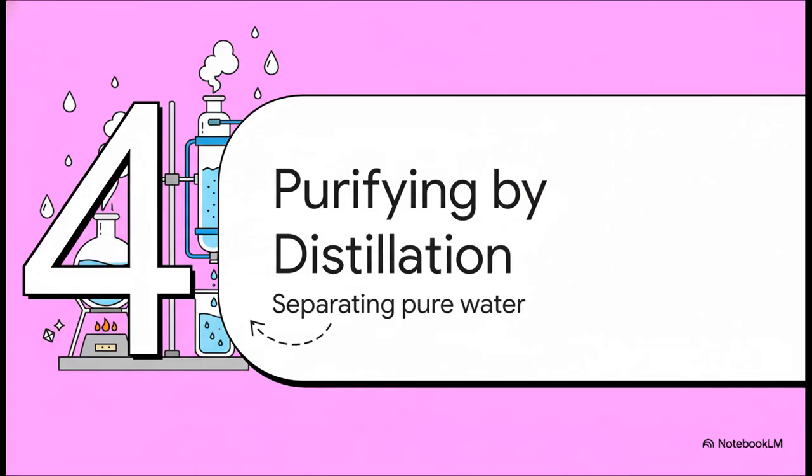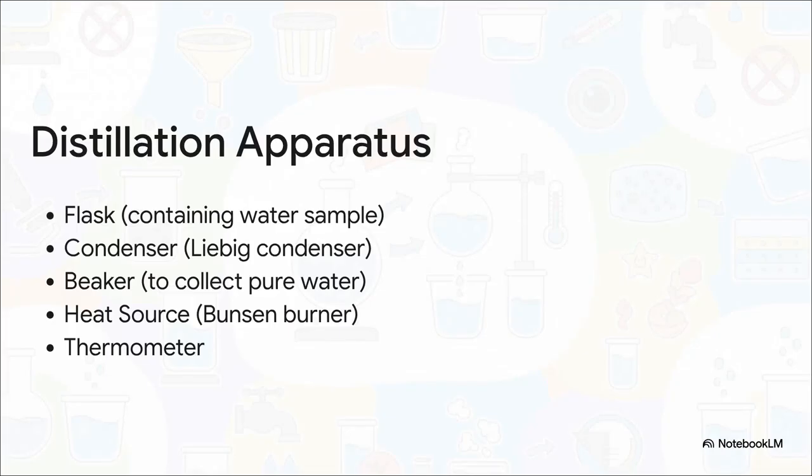Okay, now for the main event, the purification. We know there are solids dissolved in our water, so how on earth do we get the pure water out and leave all that other stuff behind? Well, the answer is a really powerful technique called distillation. So this is the classic setup, and you've got to know what each bit does.